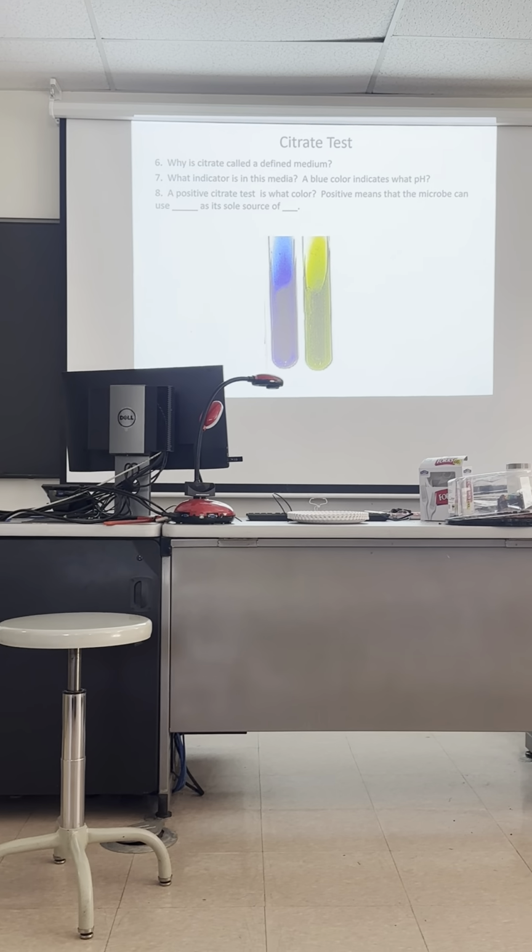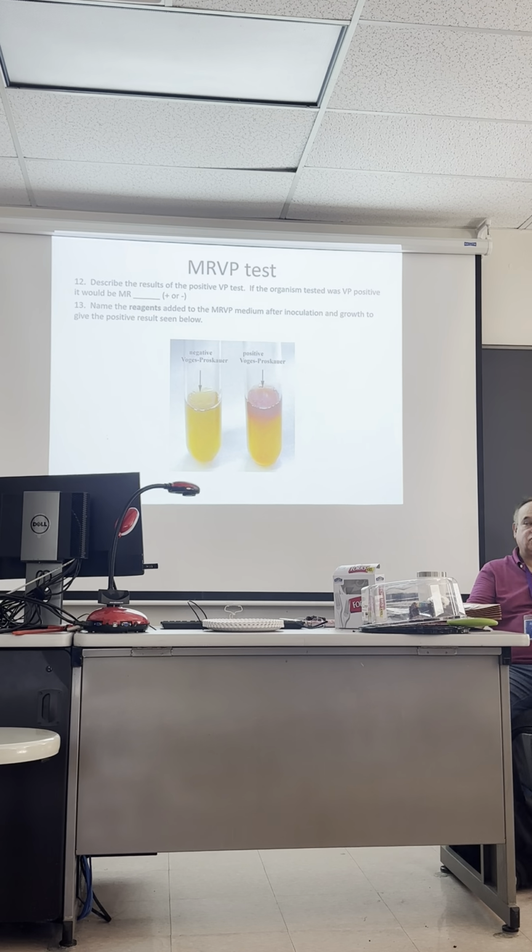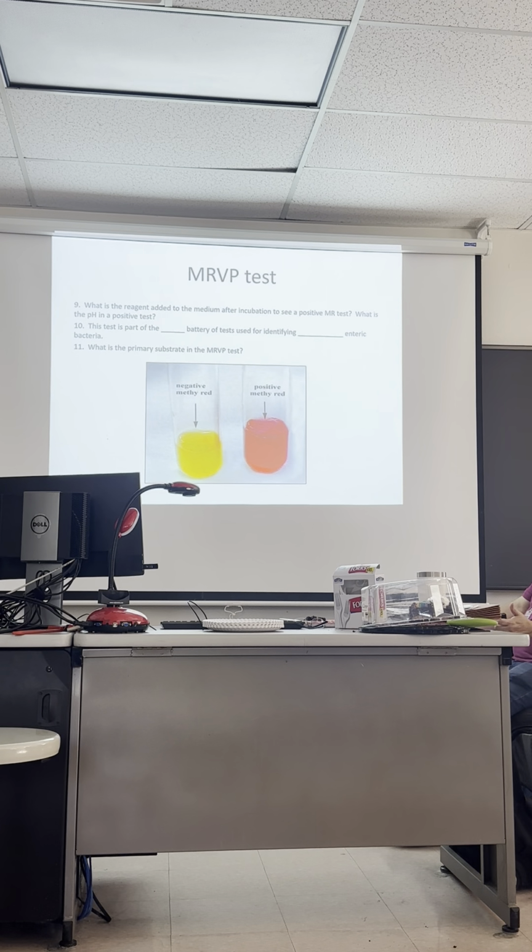Okay? All right, this is the MRVP test. Let's talk about MR first, right? What is the reagent added to the medium after incubation to evaluate the MR test? Methyl red. It's called the MR test because it's the methyl red test. And if it's positive, it turns red.